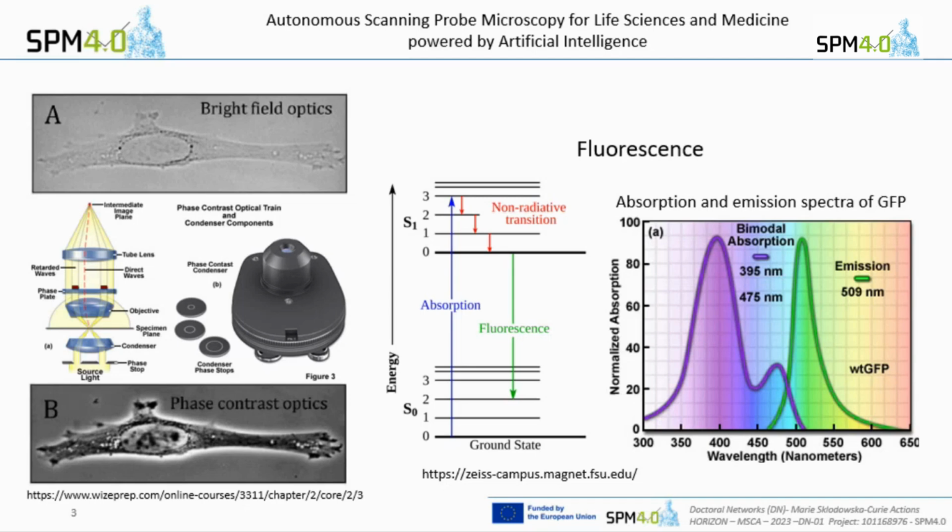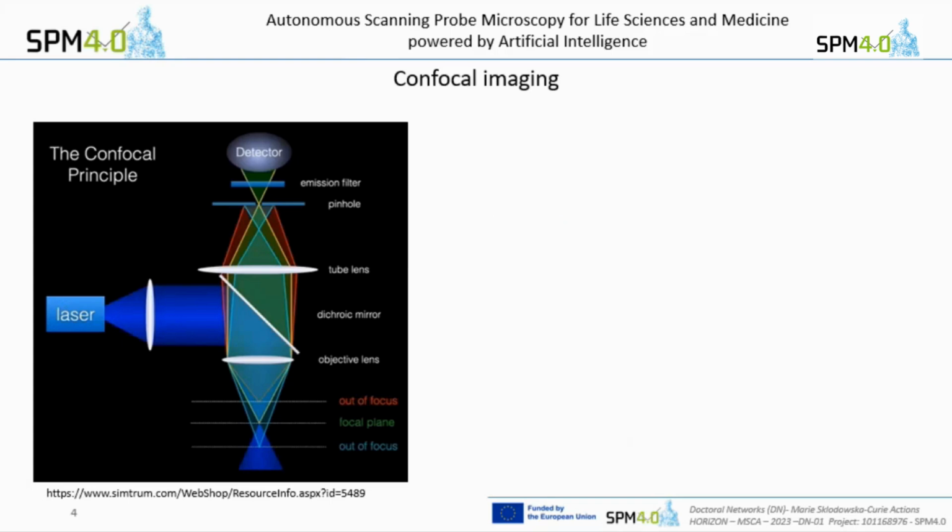So yeah, but it's all basic microscopy. If you want to go a little bit more advanced, with better resolution, one way to do this is by using a confocal system. Has anyone worked with confocal microscopy? Good. Yes.